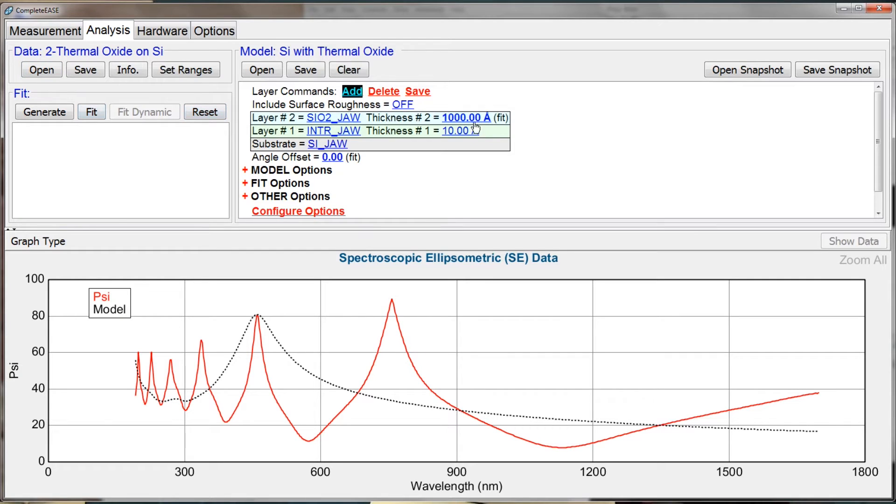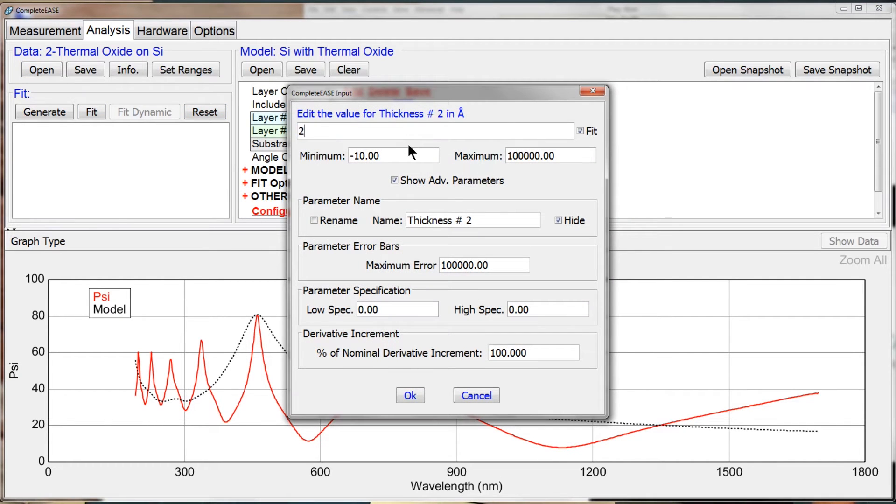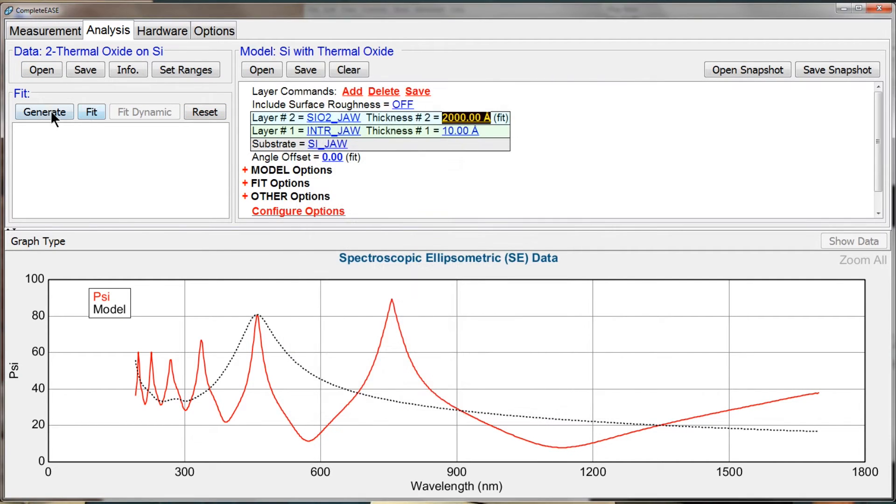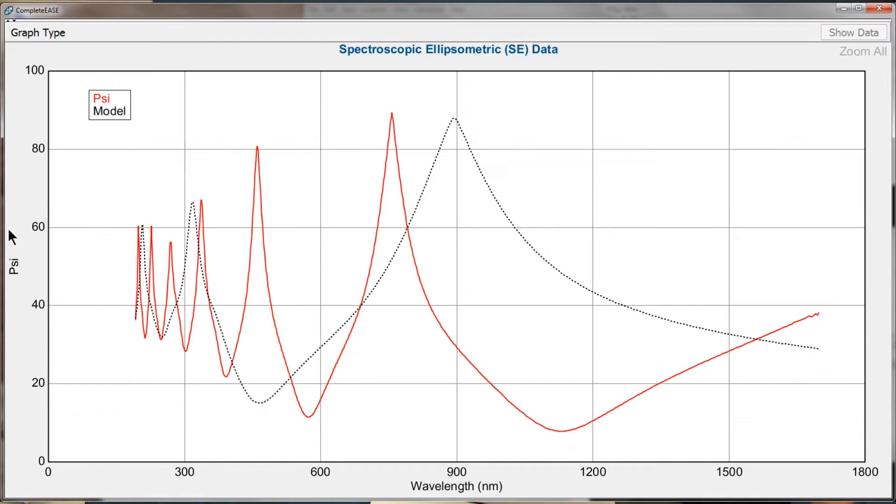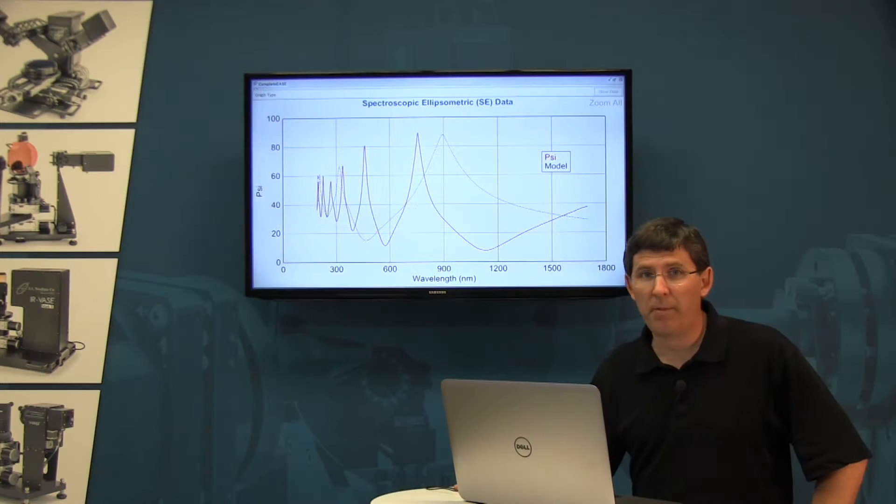Instead of 1,000 angstroms, let's change it to 2,000 angstroms and generate again. Notice that when I did that I shifted the positions of my peaks and I also increased the number of peaks and valleys in my model calculation, but still not enough to match my experimental data.